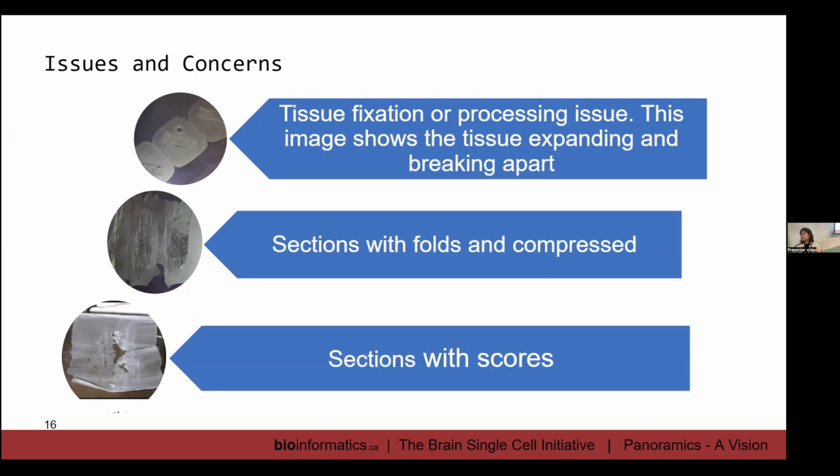So EDTA is usually the gold standard, even for IHC. So it will also work for your Visium, but you just have to keep in mind the length of time. Because if that is a very, very calcified block, I would suggest not using it at all and choosing another block or another piece of tissue if you have any. So I recommend that. So these are what you need to avoid.